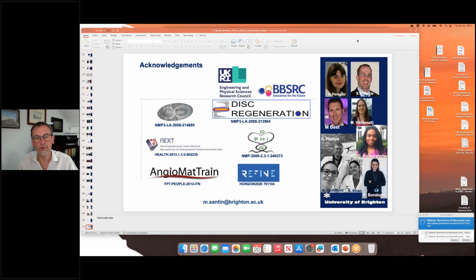And also we are looking at breast cancer cells because we are developing some gene delivery system for breast cancer, and we use PhenoDrive as a model to study the mimicking of the tumoral mass and the metastasis formation, because of the migration that PhenoDrive can encourage.